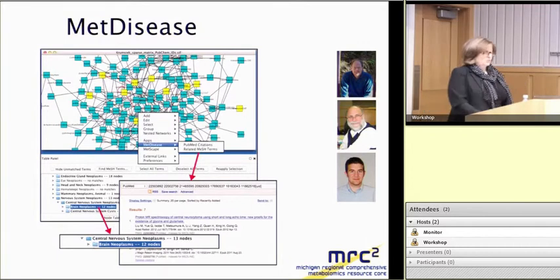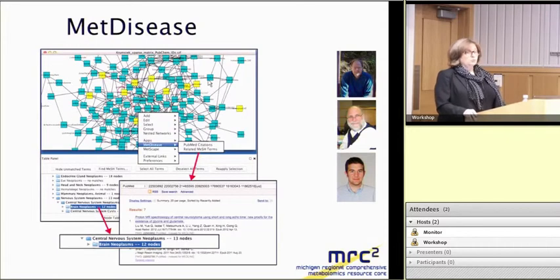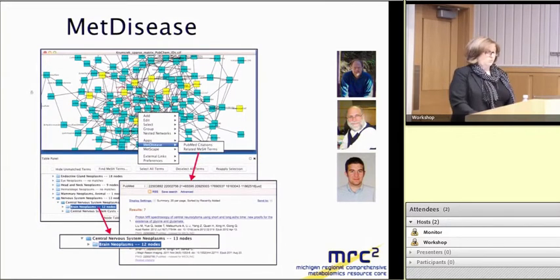And so the very important point here is that it's a standalone tool. It will work with MetScape, but it's a standalone tool, which means that you can put any network in here. And in fact, the networks that I'm displaying here, the nodes, you notice that they're colored differently from the MetScape network because it is a different network. This comes from a publication by a German group.